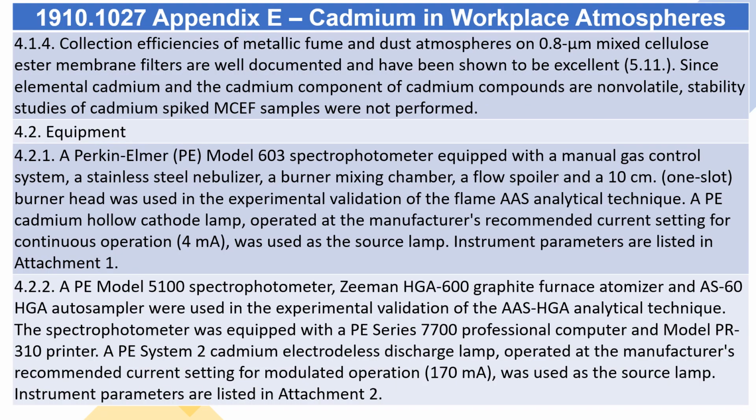4.1.4. Collection efficiencies of metallic fume and dust atmospheres on 0.8 µm mixed cellulose ester membrane filters are well documented and have been shown to be excellent. 5.11. Since elemental cadmium and the cadmium component of cadmium compounds are non-volatile, stability studies of cadmium spiked MCEF samples were not performed.